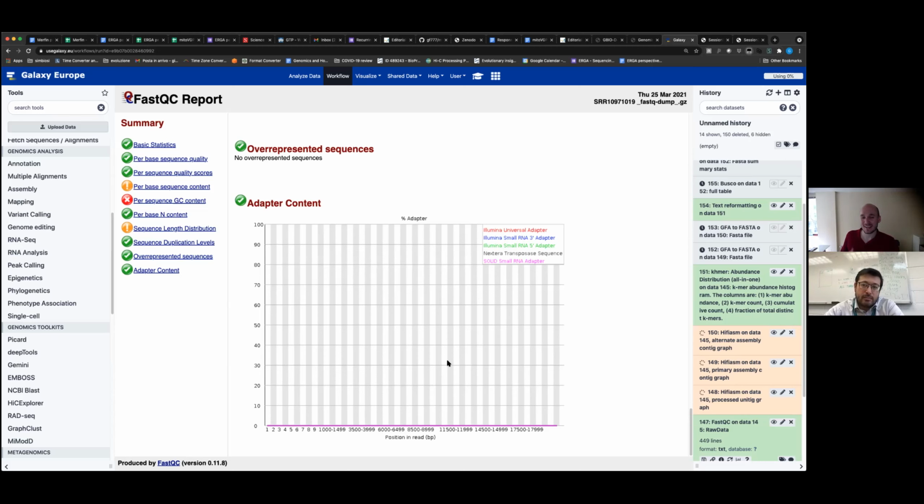It's not always the case, and it turns out that there was about 1% left, or very little. Sometimes there is this 1%, and actually it's a problem. You want to check for this because it increases the chances you make mistakes during the assembly process. So you want, in principle, to always check and get rid of them if you can.